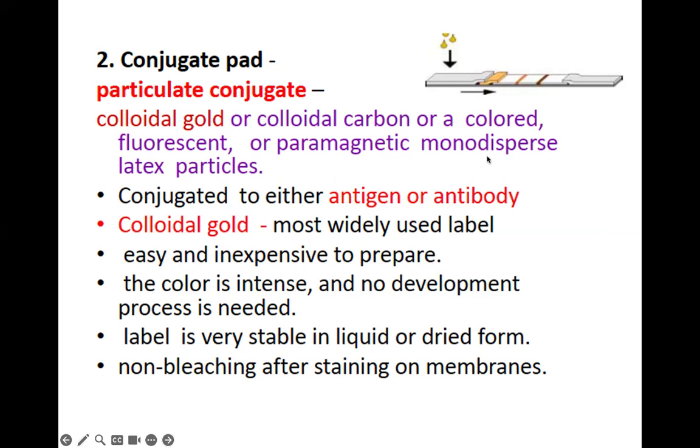But tomorrow we will focus on antibodies because we use sandwich type detection. So this is where you put the gold conjugated with antibody. And this is where you need to characterize in terms of concentration. Okay, how much of the conjugated gold antibody you need to put on top of this conjugate pad.